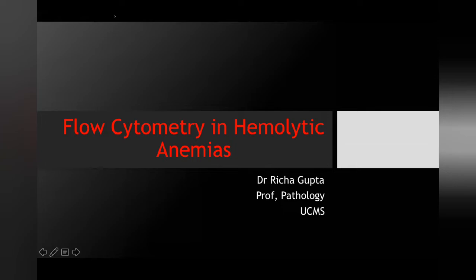And in India per se, the use of flow cytometry for benign disorders has not gained so much vogue. So that is why this topic is something which is really close to my heart. I would tell you how flow cytometer can also be used for evaluating so many benign hematological disorders as well as immunological disorders. So today I'll be limiting my talk to the use of flow cytometry in hemolytic anemias.